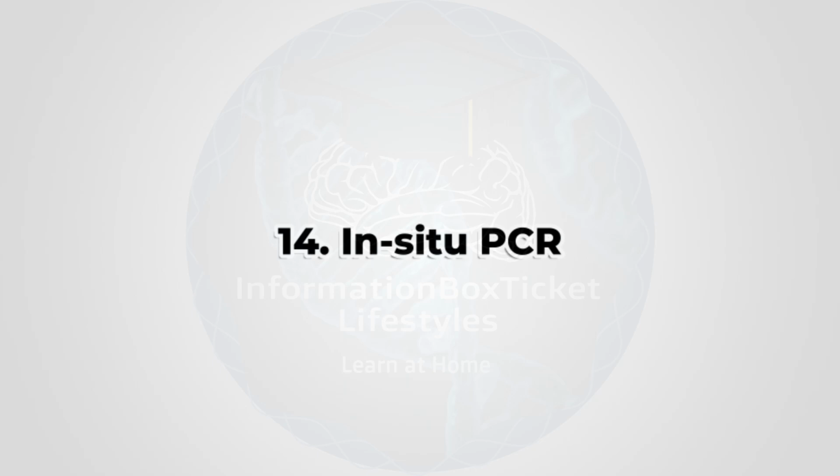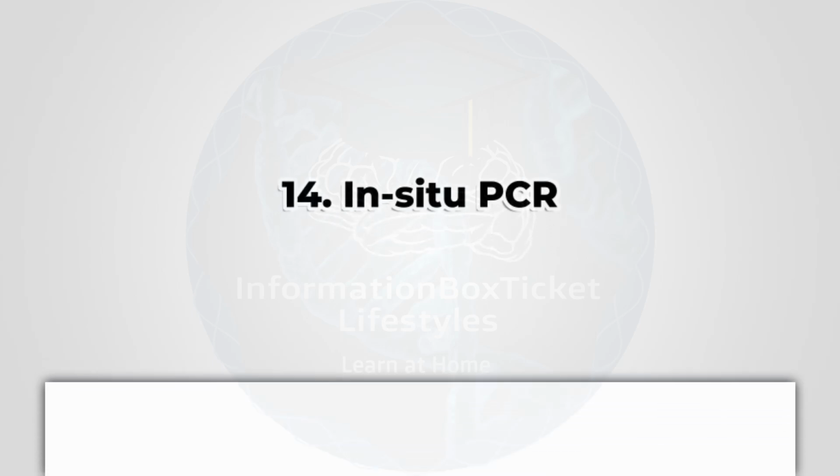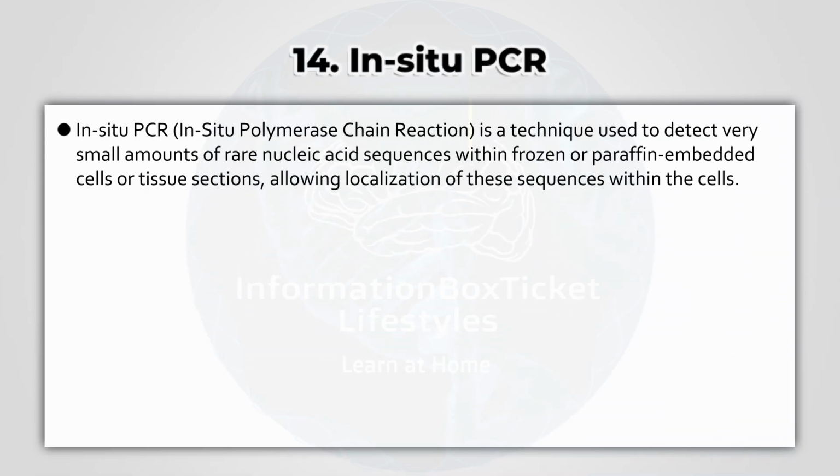14. In-situ PCR. In-situ polymerase chain reaction is a technique used to detect very small amounts of rare nucleic acid sequences within frozen or paraffin-embedded cells or tissue sections, allowing localization of these sequences within the cells.